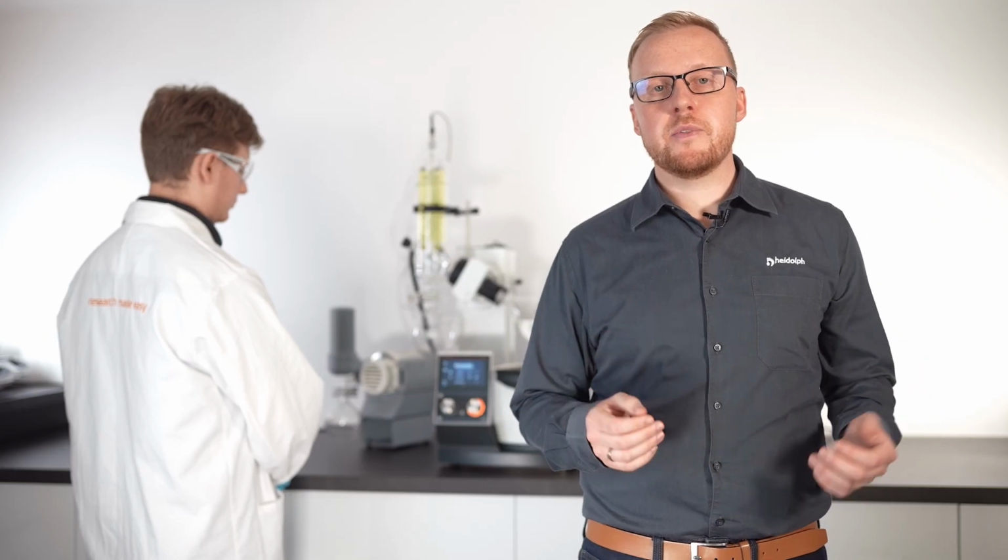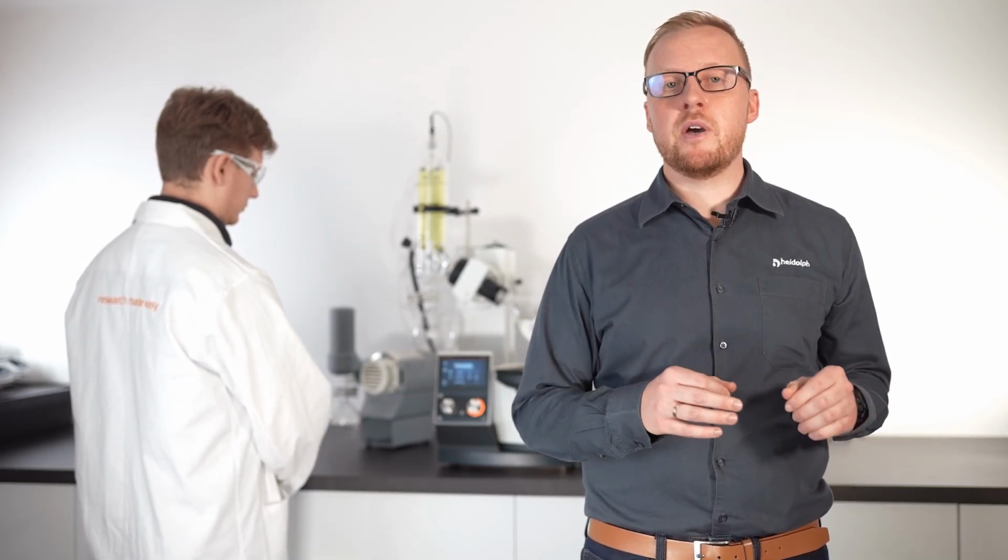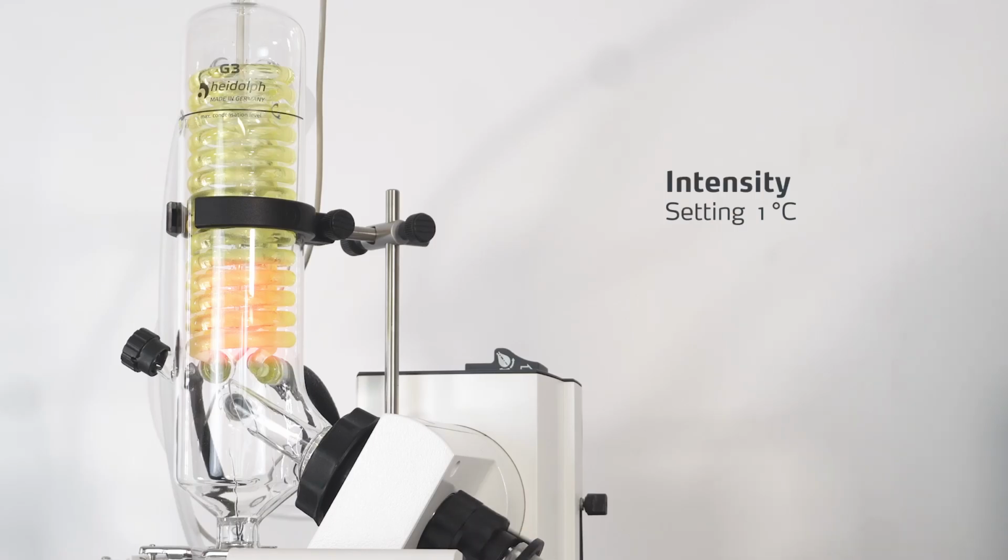Also noteworthy, you can fine-tune the efficiency of your automatic evaporation with an allowed delta T value. For example, if you work with a strong cooling source, you can adjust the tolerance of the sensor to keep the automatic evaporation always on the most efficient level according to your physical system limits.